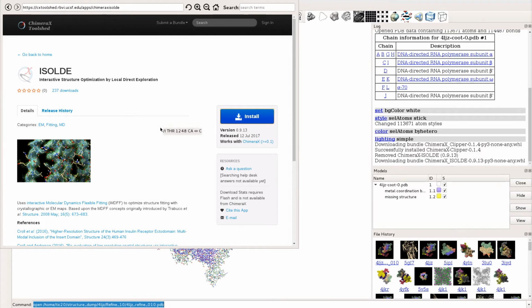This is a work in progress and still in need of some optimization. One big caveat is that the symmetry contacts are currently visual aids only. They do not yet take part in simulations, although I plan to implement this in the future.